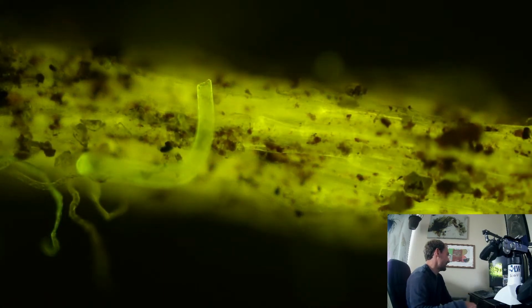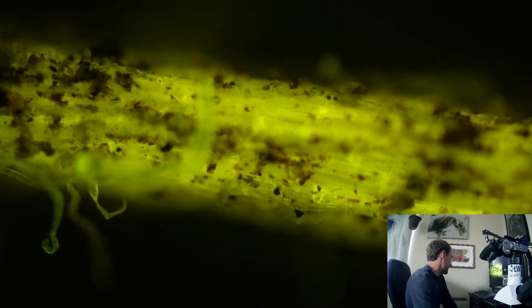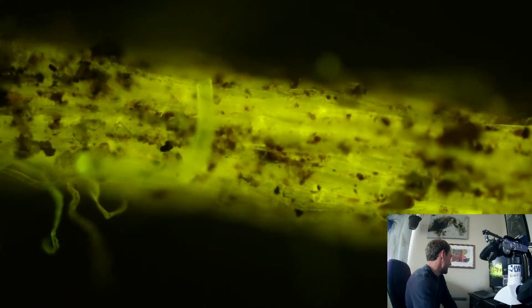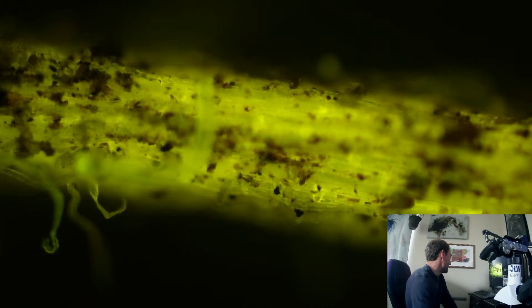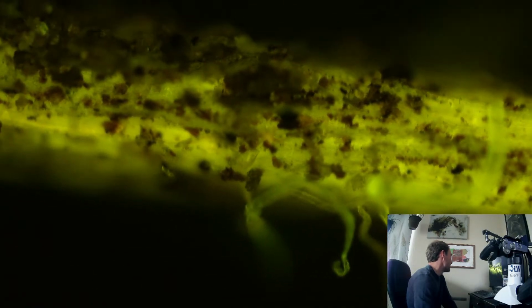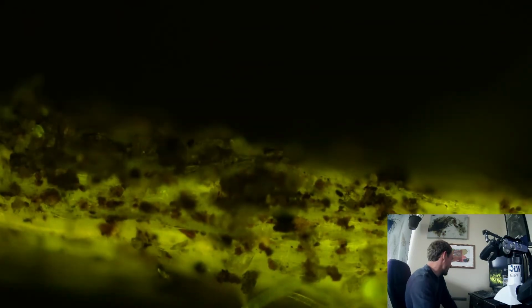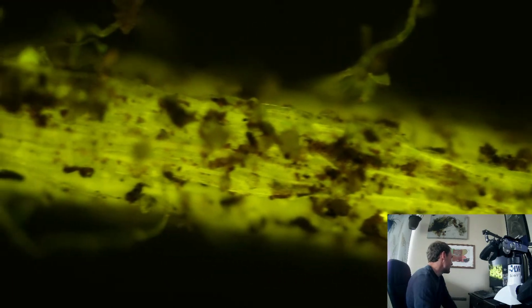I don't know if that's just a root hair, or it could be, it's definitely a tube. You can see right there on the top. But it's kind of laying on top of. Could be a little piece of, I don't know, hair or something, but let's move on. So we see all the aggregates and the soil right there, all stuck to the root. Let's move on to a little bit clearer spot, see what we can see.